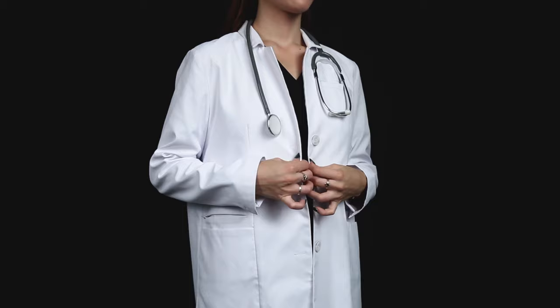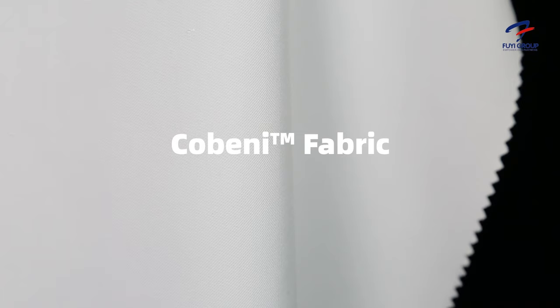Hi guys, my name is Jamie from Fui Group and today we're going to be talking about one of our new lab coats. It's very high stylized, so let's talk about the fabric first.